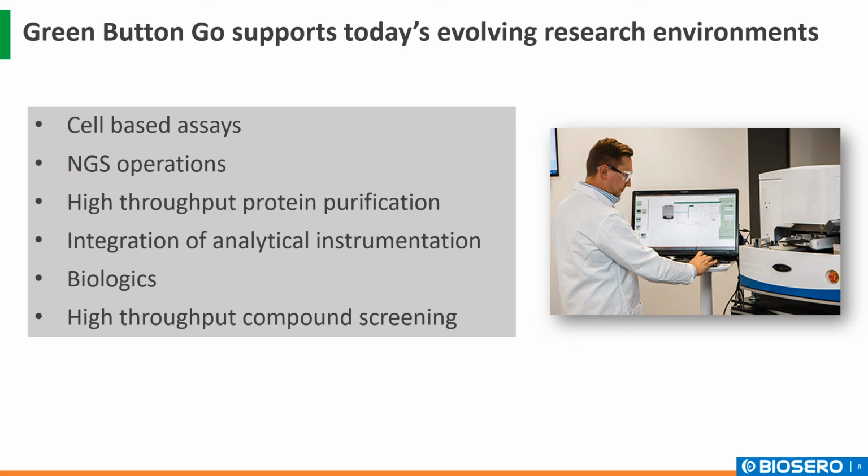This requires seamless coordination of instrument operation as well as real-time monitoring of data. For example, cell-based assay methods. Many of these assays now include real-time monitoring of cell culture processes such as confluency measurements, feeding and expansion, gene expression monitoring, cell line engineering, and clone selection, etc.